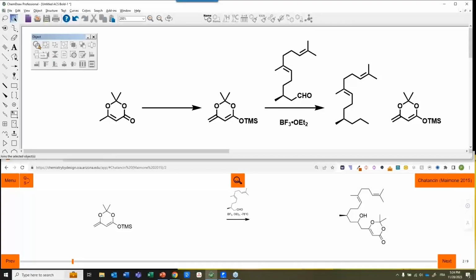Since version 20 or 21, I don't remember exactly, we've added an icon for the joining function. The joining function is you select 2 atoms, like this, or you select 1 atom, you hold Shift, and you select another atom, and then you hit Control J, or join. That's going to join the 2 molecules together. An alternative could be, of course, that you do this. It's not very elegant, but that works.